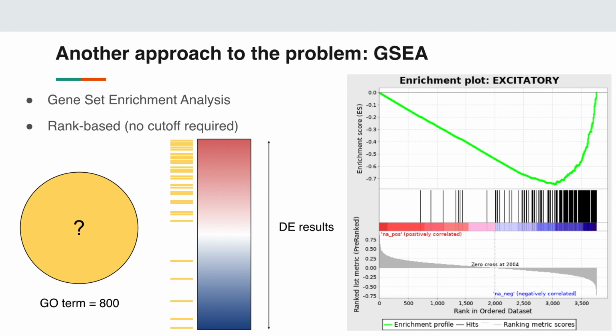So this is just a graphical representation of this significant skew, but there will also be a table result where you can select on a p-value threshold, or even better on an FDR threshold, if you are performing multiple tests of the gene set enrichment analysis as well.